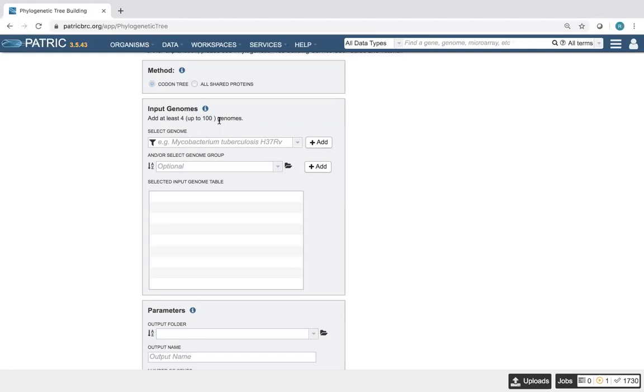So think about what it's going to look like in the end. For just general knowledge and experimentation, to see which groups belong together and how they settle out, and then choose specific genomes from that, go ahead and load up on the genomes if you don't mind waiting for the time. But for your publications, you might want to be a bit more careful in what you choose, always keeping in mind what's going to look good in the publication.